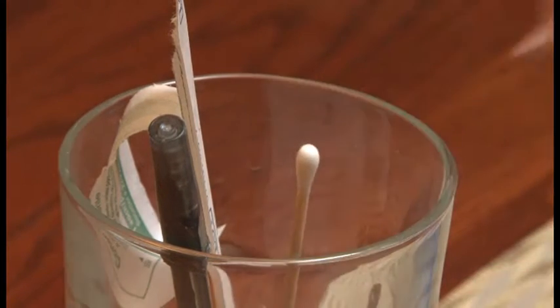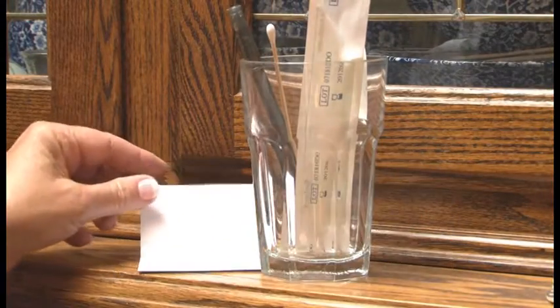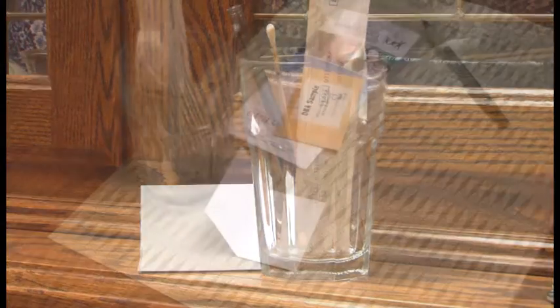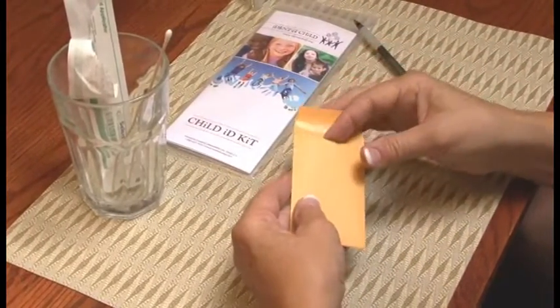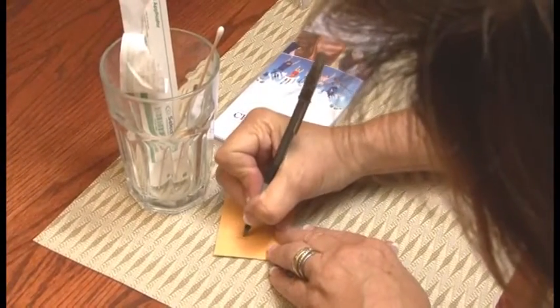Leave the flap on the DNA sample open and set the sample and glass holding the swab out of reach of inquisitive little ones while they both dry. When the sample and swab have completely air dried, usually an hour or so at room temperature, remember not to touch them to see if they are dry, because doing so will contaminate them.